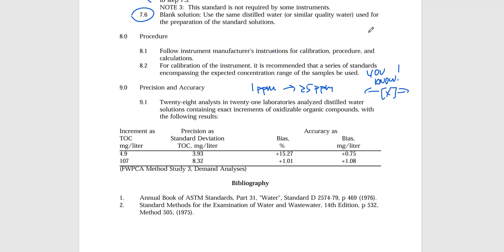If you do have samples that go below or above, you've got to do something to them. You've got to expand the calibration window. You've got to dilute the samples, or concentrate them, do something to them in some form or fashion in order to fit that range. Otherwise, we should not actually be recording legitimate numbers on that report. We've got to get creative.